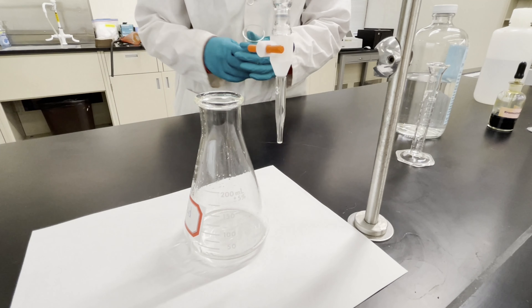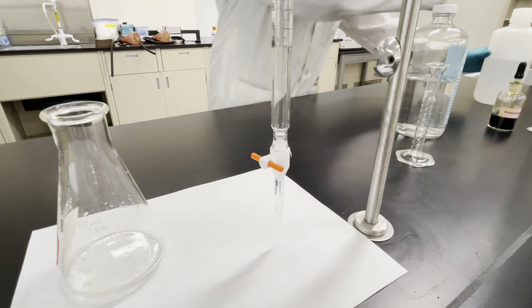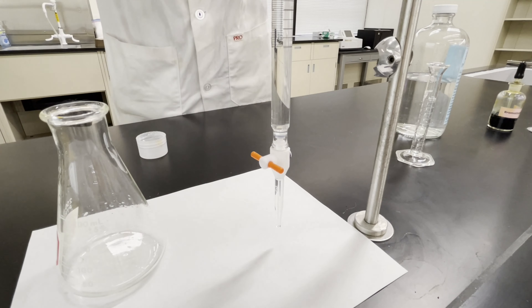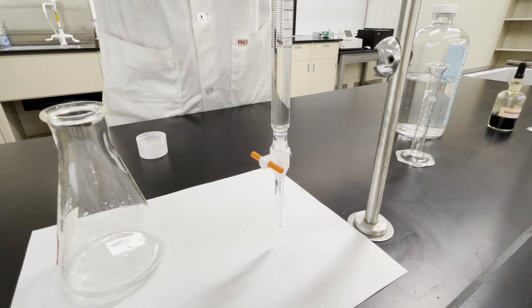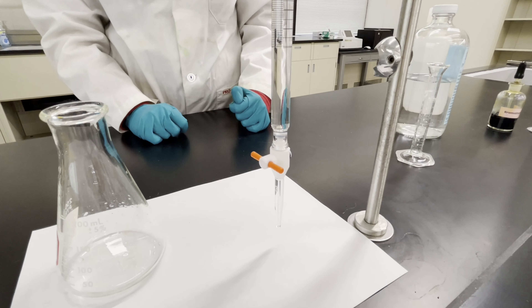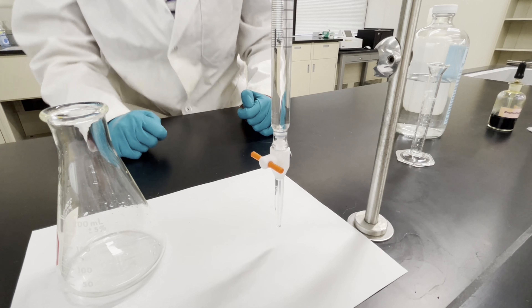Next, I will add some base to the burette. Then always make sure you take an initial reading of your burette. Mine is at about 31.5 milliliters.